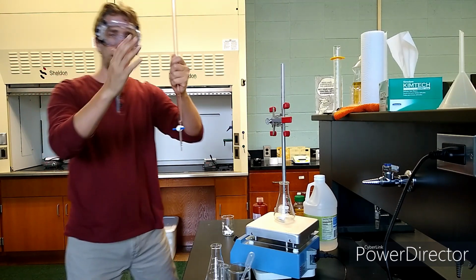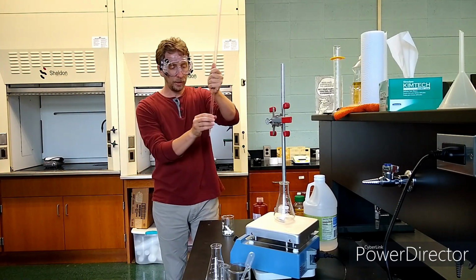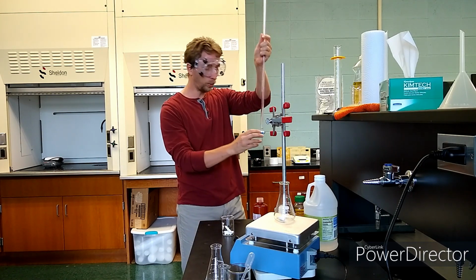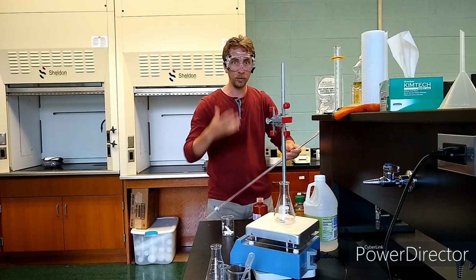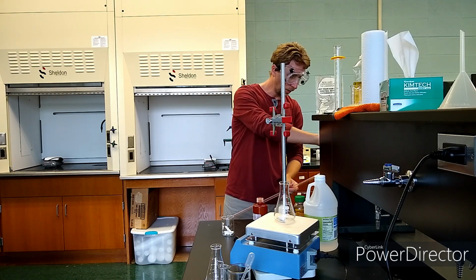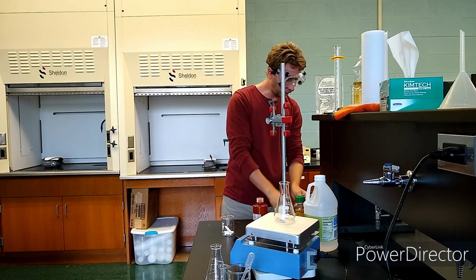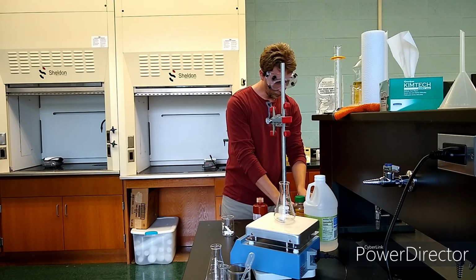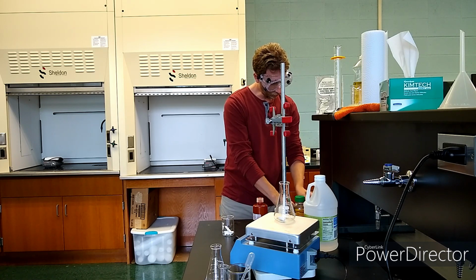So I'm going to make sure that the burette's not leaking anywhere around the stopper, and of course that it drains smoothly from the tip. So I'm just going to fill it up with water, and that will also help to rinse it. So I'm just turning on the water here and filling her up. And there we go.